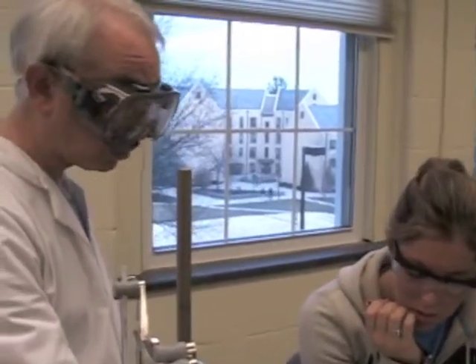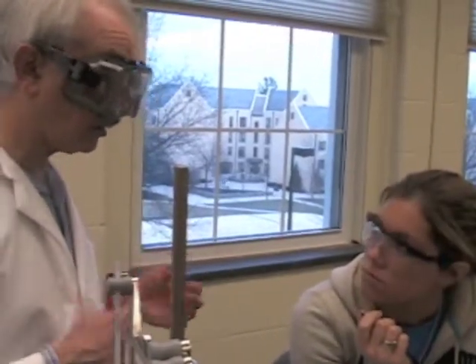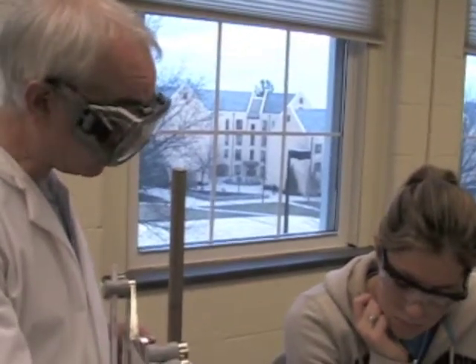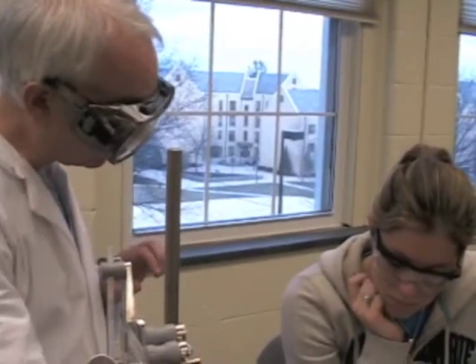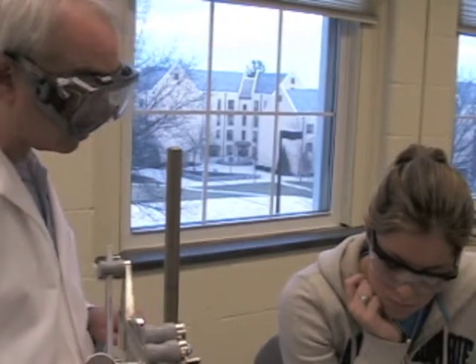So you told me there were two reasons why these volumes were increasing. One was that the water was vaporizing, the other was the air was expanding. And we just want the water vapor part, we don't want the air part. We want to measure the air part separately so we can subtract that out from all of these and get just the water vapor part of all of these. So how can we get just the air pressure without any water vapor?